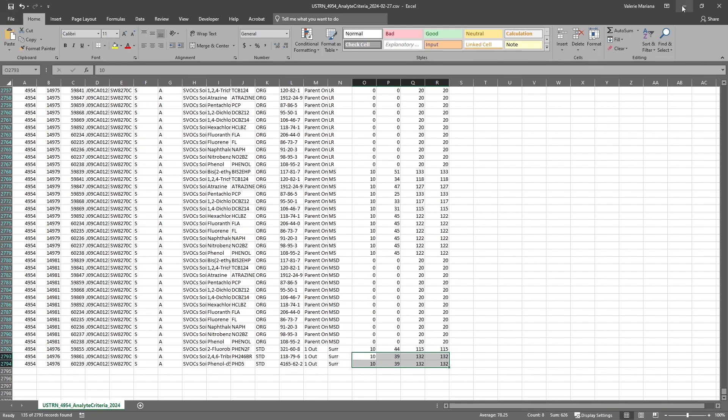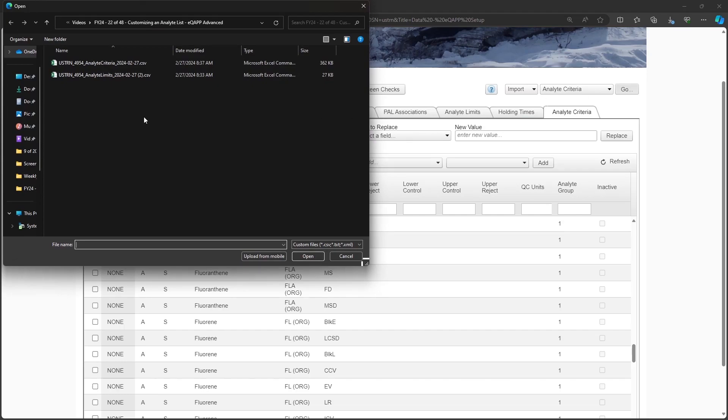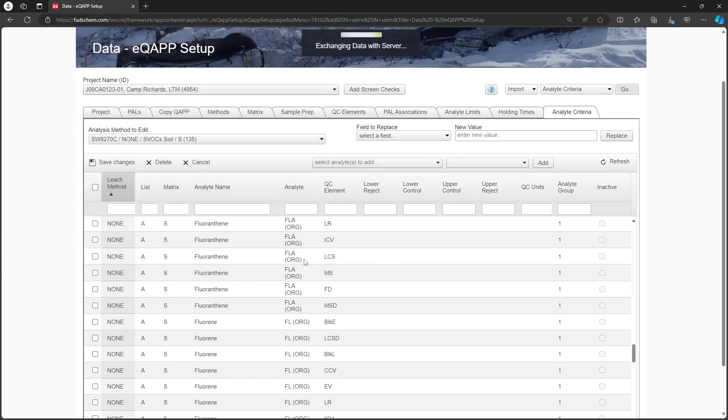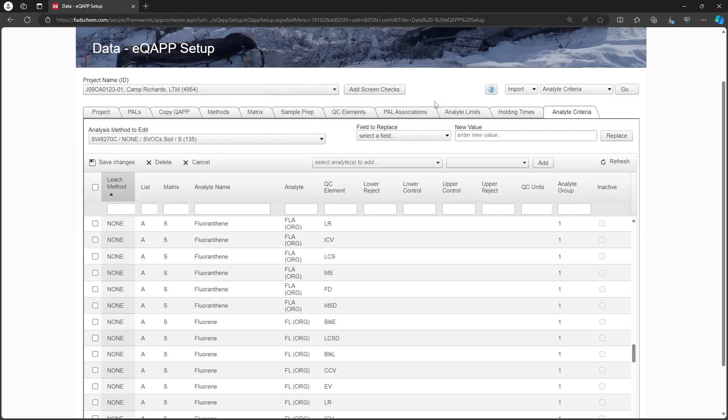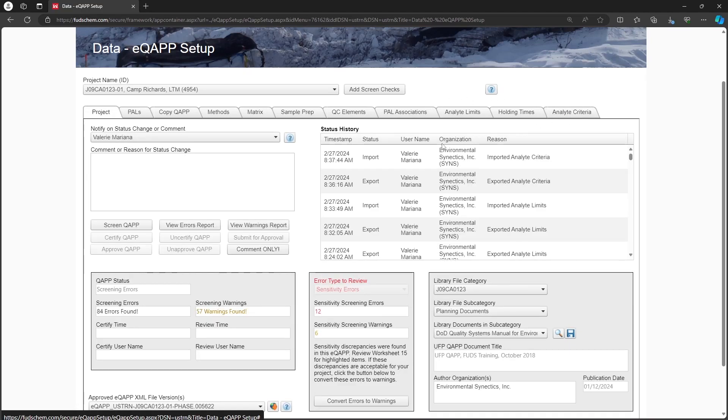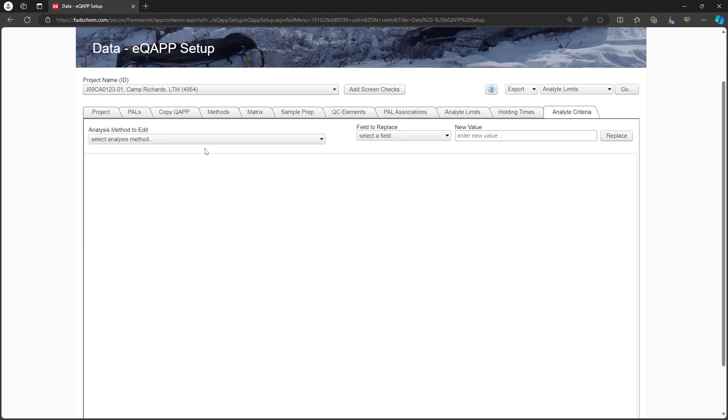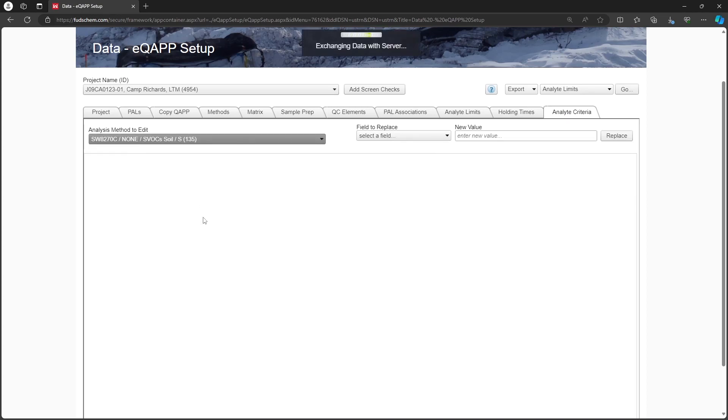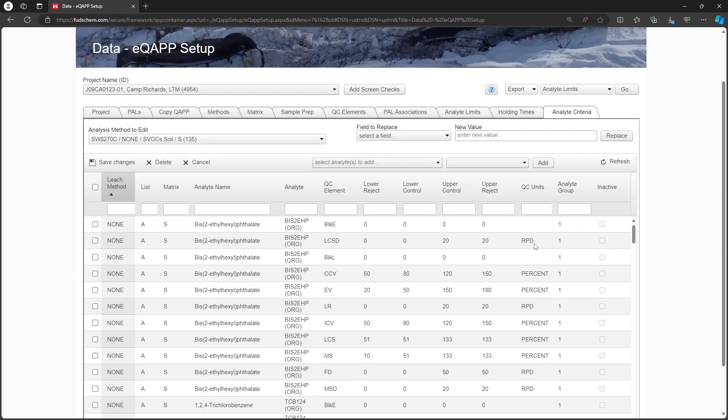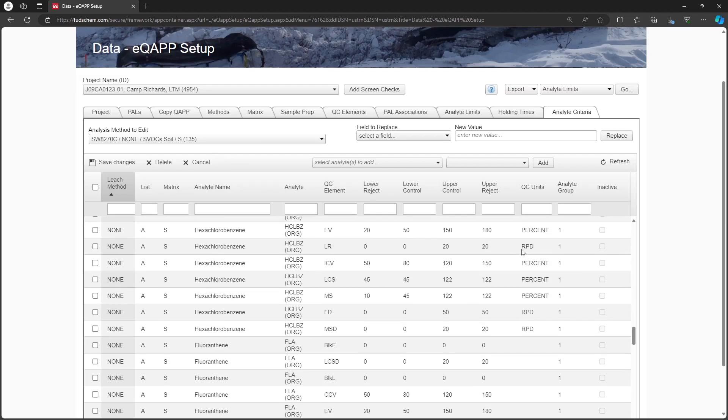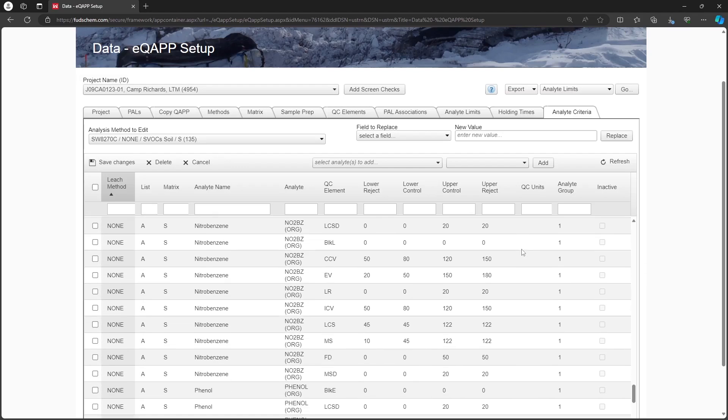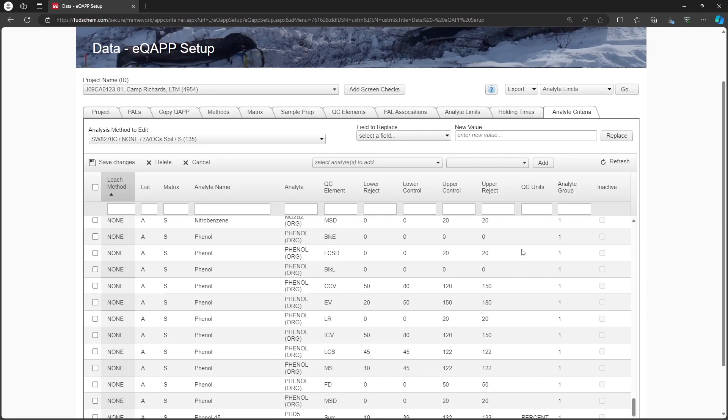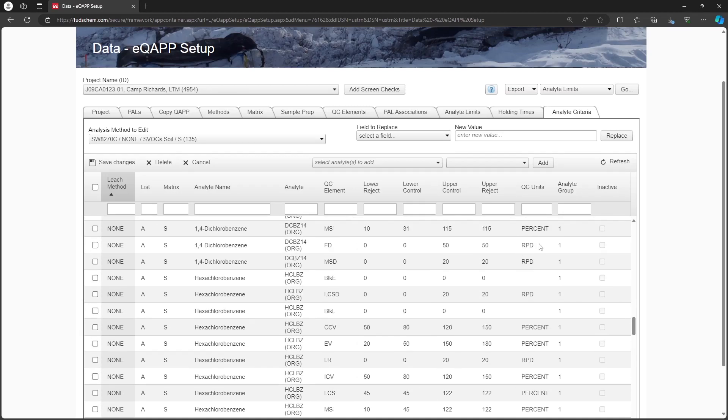Back in the EQAP, change the drop-down to Import Analyte Criteria. Click Go and import the file. Once imported, select the method again on the Analyte Criteria tab. We can see that the limits are populated. Once we update the QC units using the field to replace option, the EQAP will be completely updated for our new Analytes.